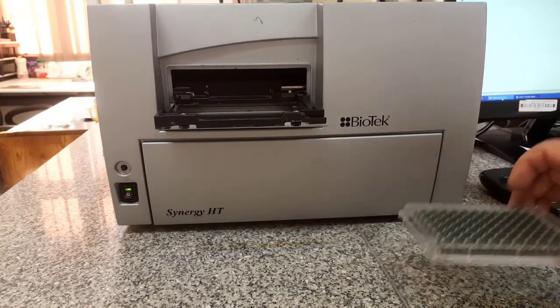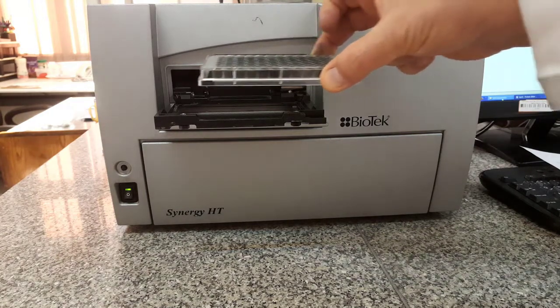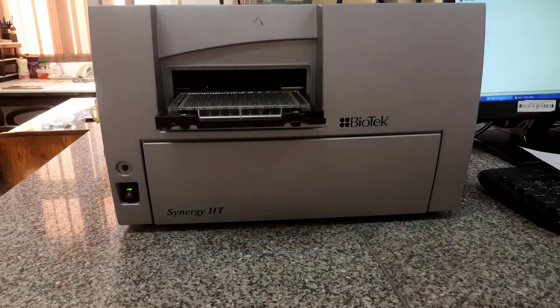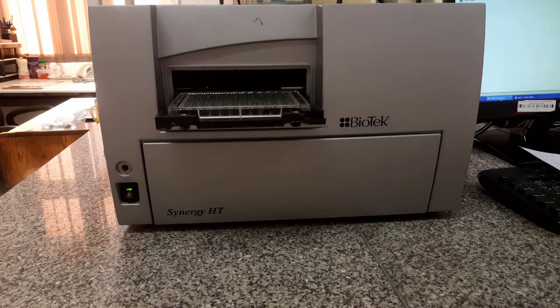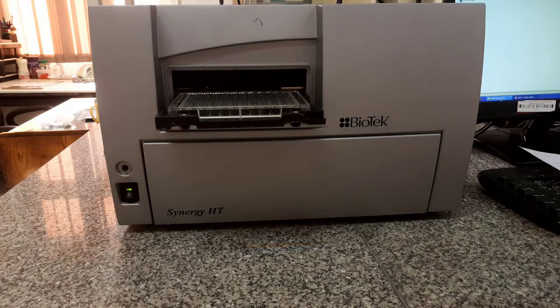Place 96 well plate in the plate carrier of the microplate reader so that the well A1 is in the left rear corner of the carrier. Please pay attention to the letter A1 in the left rear corner of the carrier of the instrument. Actually, well A1 in the 96 well plate should be beside letter A1 in the left rear corner of the carrier of instrument.